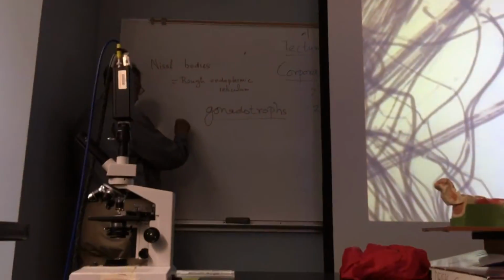And here, what is the name of the cell? This is a Schwann cell, no doubt about that. This is a Schwann cell, this is another Schwann cell, and another Schwann cell, and you can see these neurofibril nodes, or nodes of Ranvier.